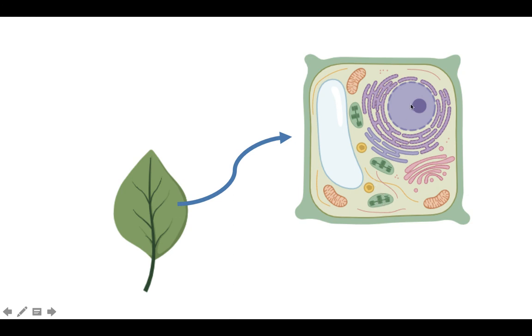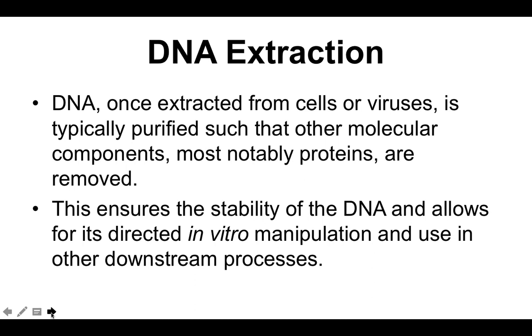No? Okay, so the second key principle or idea that you want to remember from time to time is the fact that DNA, once extracted from your living system, from your cell or from a virus, needs to be purified by the removal of molecular components, mostly proteins.